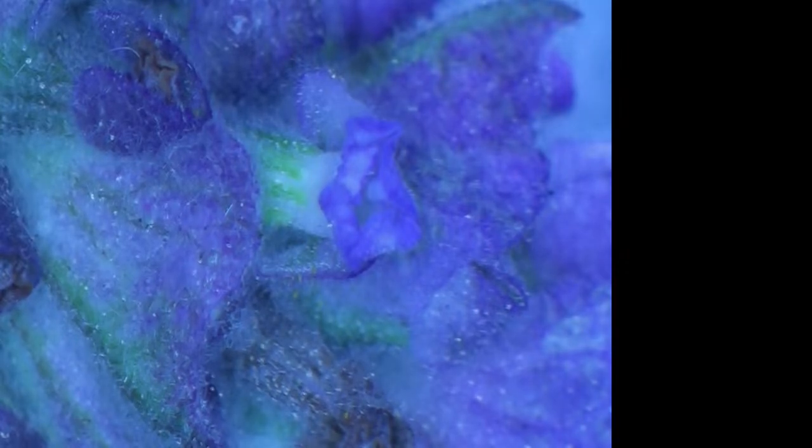So you saw the lavender leaves. This is lavender flower. And I can't zoom out much on this one. This is a dissecting scope, but it's still pretty high power. So I have to move along.